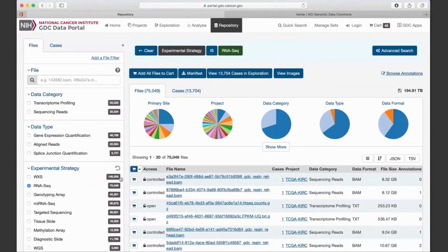Okay, and another question: do you support multiple tumors per patient ID, such as heterogeneity studies or tumor-met pairs? Yes. Colin mentioned the aliquot-level MAFs. The variant calling that we have is for every tumor aliquot we have; we find a normal pair, and then we do variant calling.